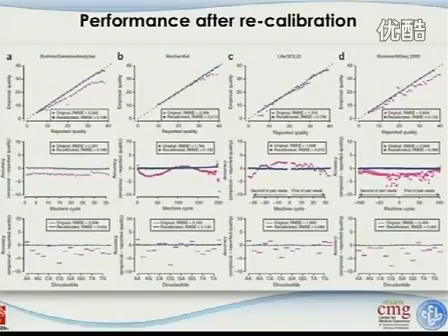Okay, let's look at the performance after the recalibration. You can see we are now looking at these blue dots here, not the purple. Purple ones are those before the recalibration, just as reported. After this recalibration, you can see that most of the points go back to where they're supposed to be, on this 45-degree line. For accuracy, it becomes 0 here, and here it is minus something for the initial one. And for the dinucleotides, everything goes back to around the 0 line.